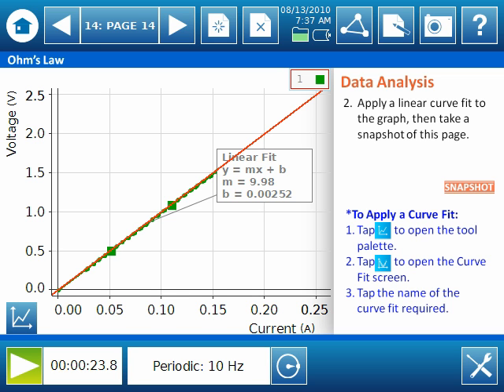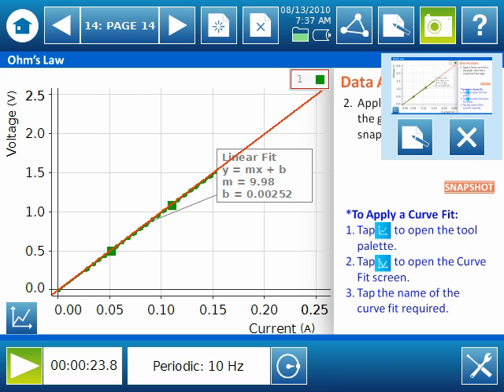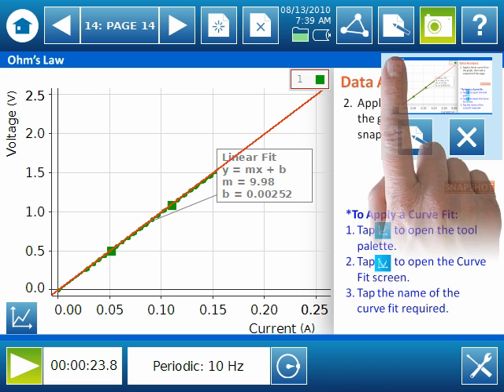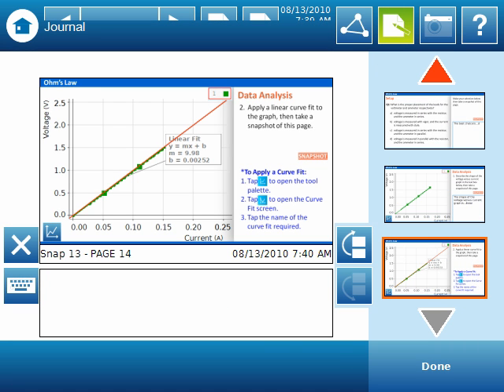Note that the characteristics of the curve are now shown on my graph. I want to capture that, so I'll take a snapshot and add it to my journal. You can see here that the data and information in the curve fit legend have now been captured and added to the journal.